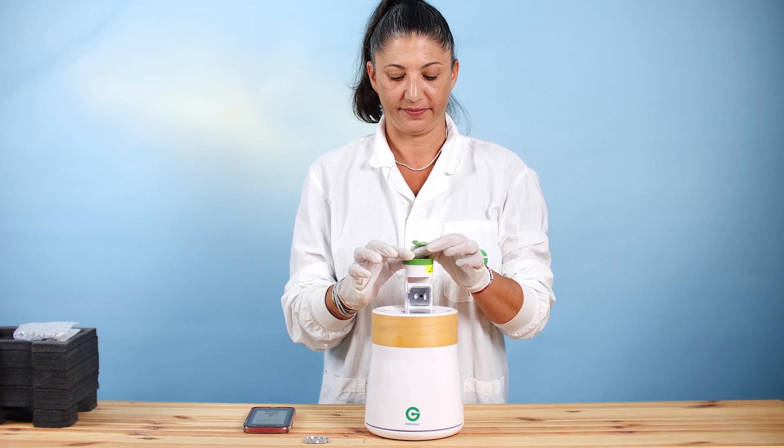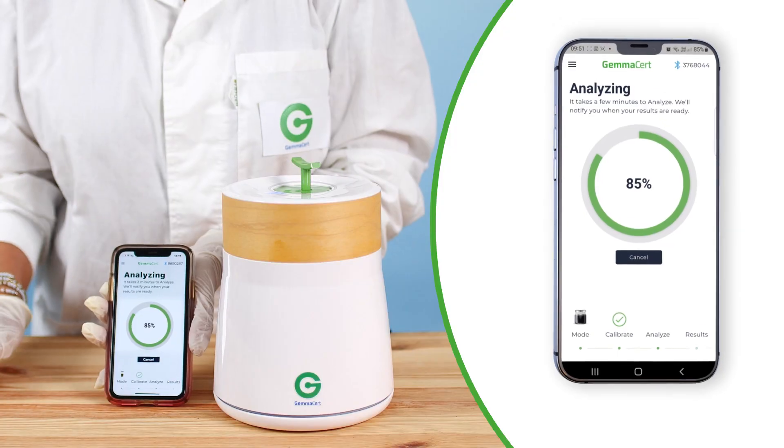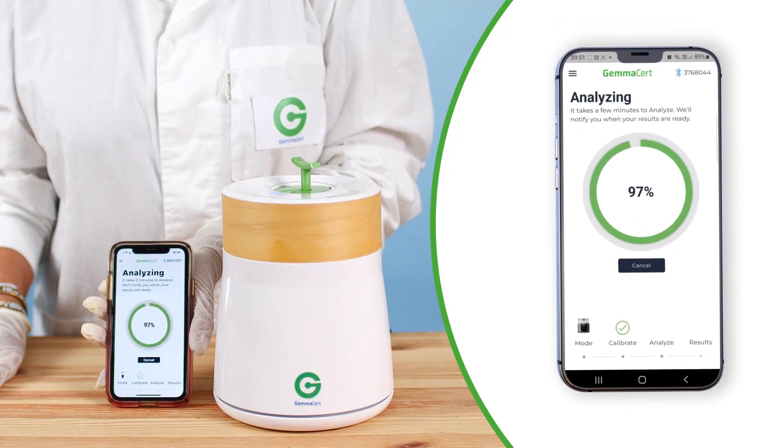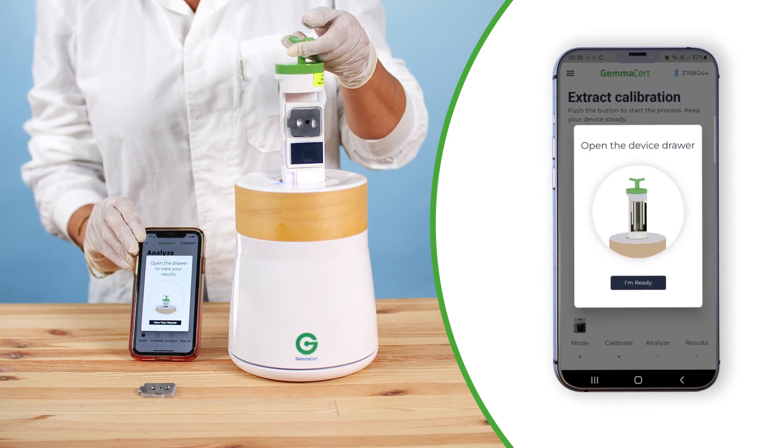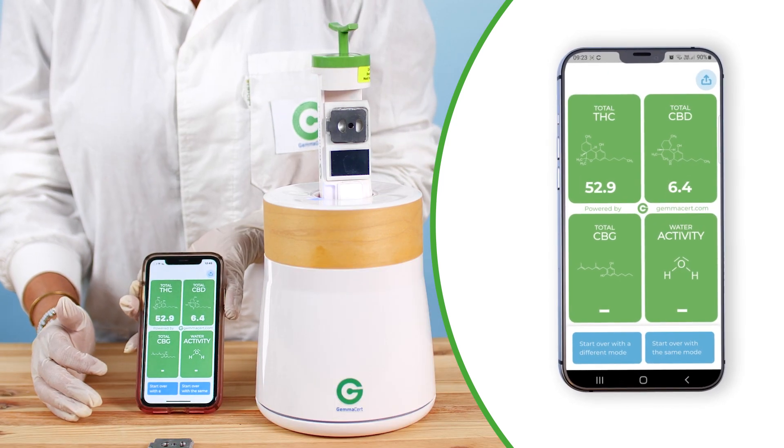Drive the drawer down gently using the green handle. Press Analyze on your application to start the analysis. When complete, the app will notify you to pull the drawer up. Press Results to display your results.